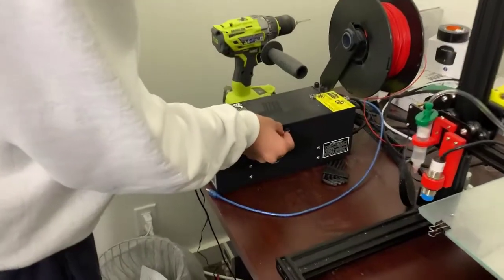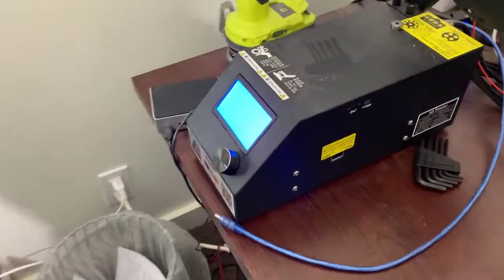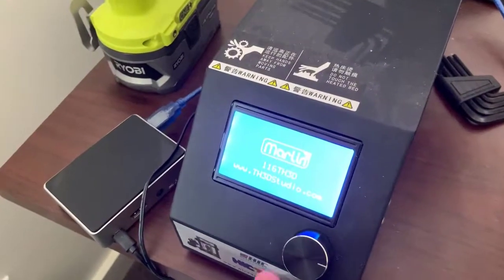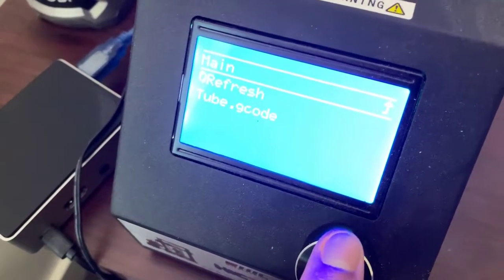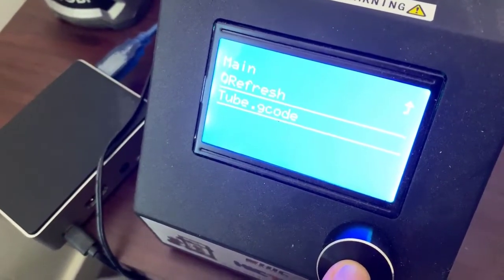Now that we have the file on the SD card, we can insert it into the printer and then print from there. Insert it into the printer and turning it on. As you can see, it's booting up. Now we'll just go to the print from SD card menu, and as you can see we have the file here. And we should be ready to print.